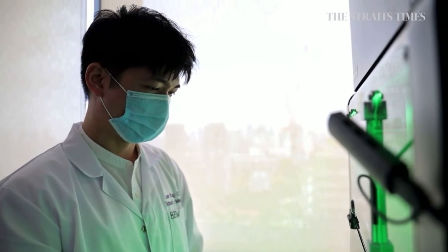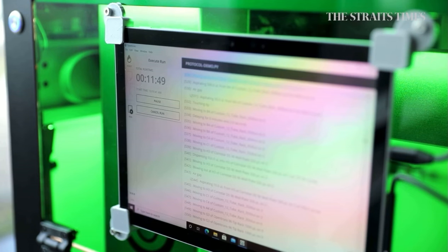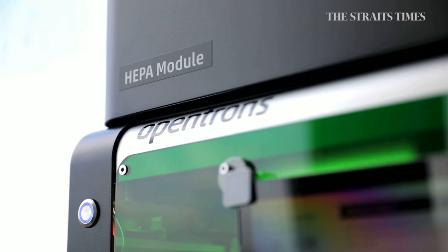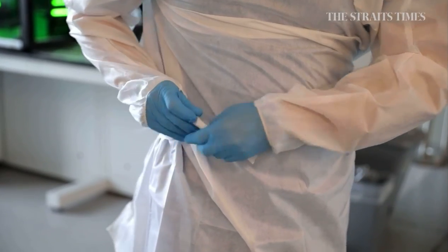They've also been asking me whether I'm okay with all this direct dealing with the samples itself. But I tell them as long as I'm taking proper precautions, everything will be fine. The lab follows rather strict rules, external regulations on lab safety. So it ranges from the infrastructure of the lab, the airflow, to personal PPE that we have to don on, to actually the lab processes, the training. And so the lab is a fairly safe place to be.